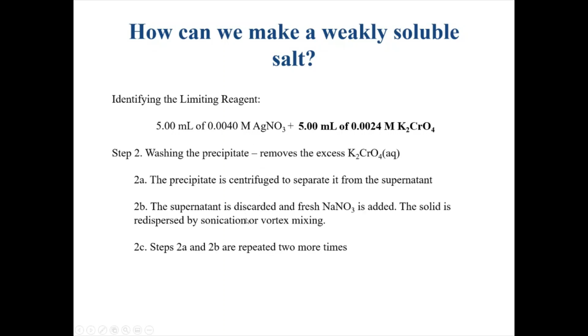Okay, so the next thing you're going to do is, once you've made your solid, you saw that nice bright red precipitate form, we have to isolate it and get it pure. So the reason why we're going to wash the precipitate is to remove this excess potassium chromate.